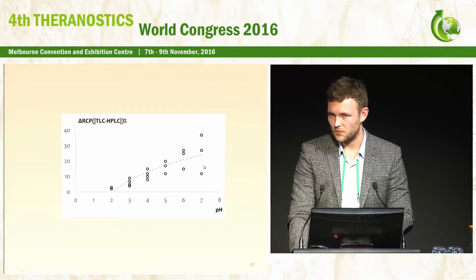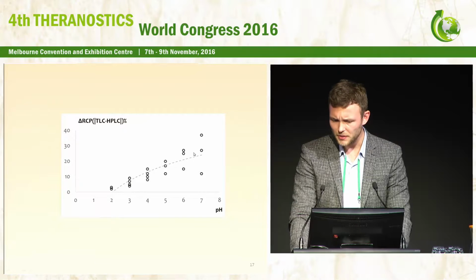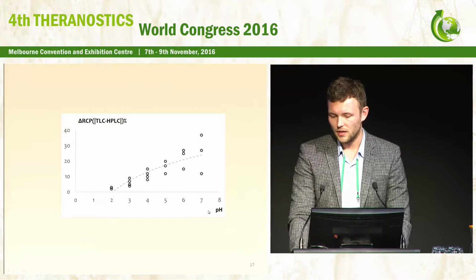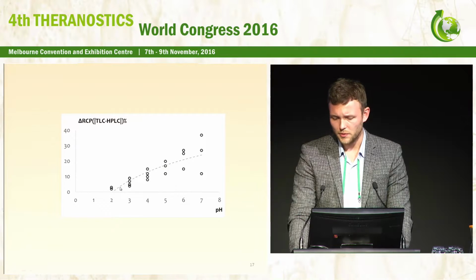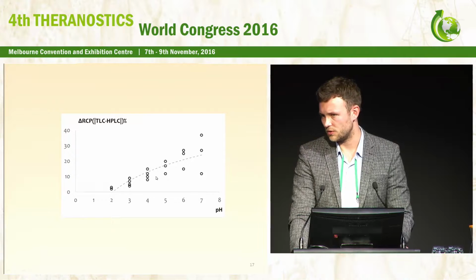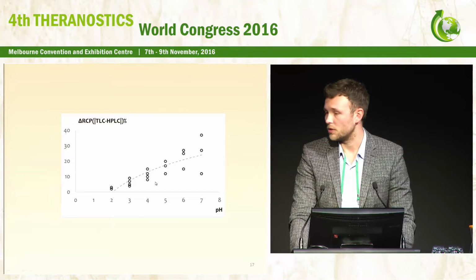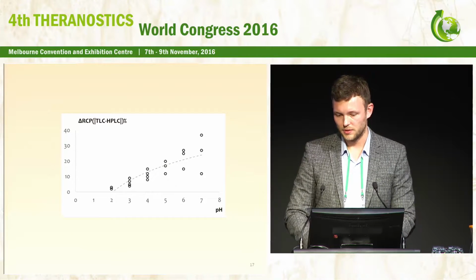The difference between the TLC methods and the HPLC methods depends on the pH level of your solution. Of course, in the normal area of the radiopharmaceuticals, it is not so high, and as I told you, with the normal routine preparations there is good correlation between this method and HPLC.